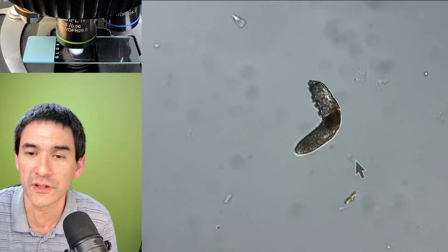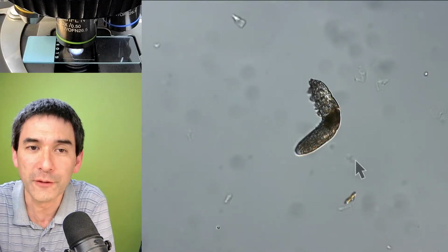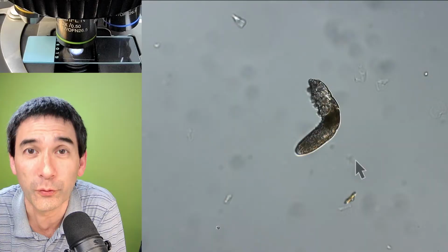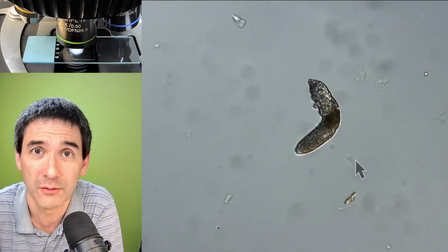The question Tino Coco is asking: human face mites, is that a type of face mite? There are different species on the human being. There are 2 different species, at least documented up to now. And of course, the different mite species living on other mammals. Yeah, not surprisingly.